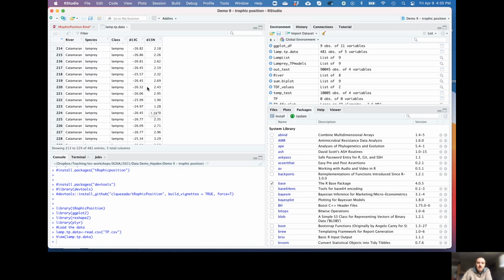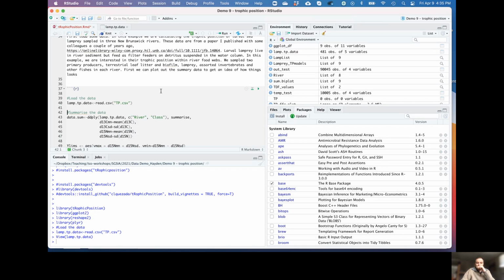And you will notice that I've broken one of my prime rules here, and I've got my isotope ratios in here with 2 decimal places. So that's a slap on the wrist for me. And yeah, do as I say, not as I do.